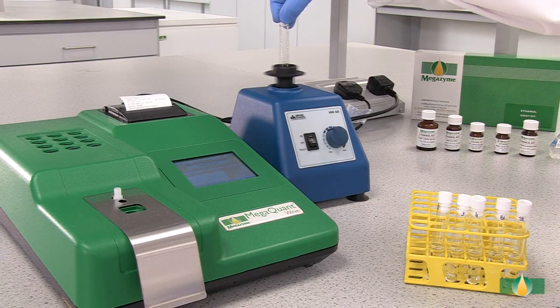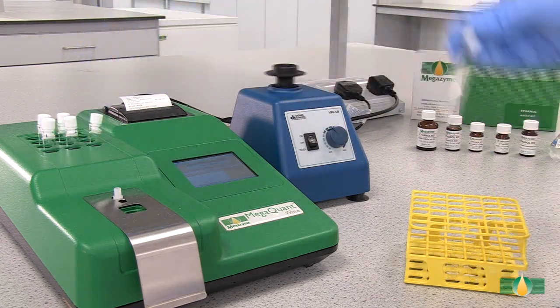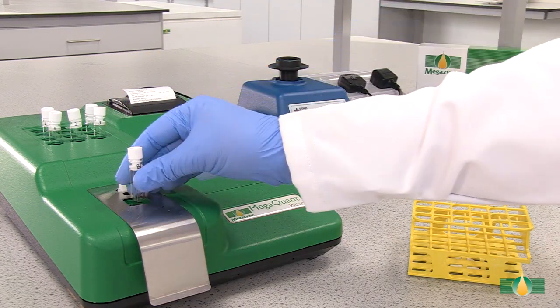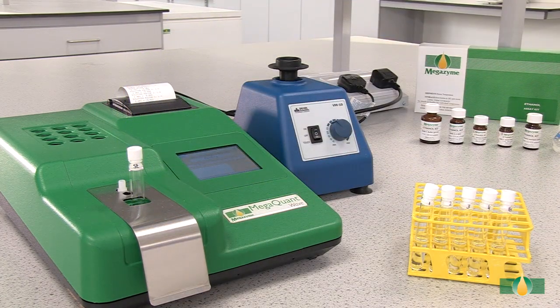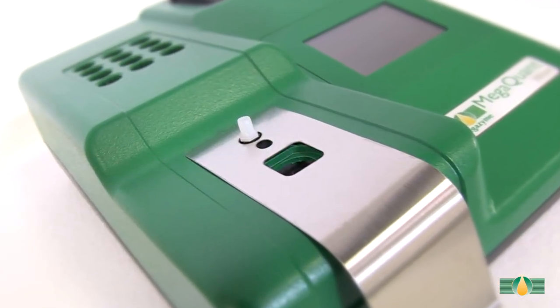When all of the components have been added, mix the tube contents thoroughly and incubate the tubes in the 37°C heating block for approximately 2 minutes. After 2 minutes, record the first absorbance reading A1 at 340nm for all of the assay tubes. In this demonstration we are using the MegaQuant Wave spectrophotometer set to read at 340nm.